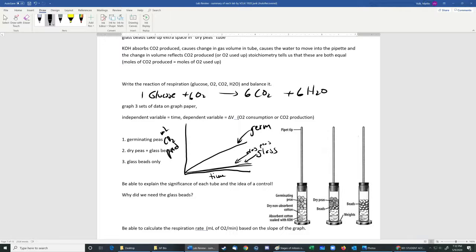We should not be looking at the peas as photosynthetic plants at this point. There isn't any photosynthesis going on because the peas are at a place in their life cycle where they're using the stored up energy in the seed itself, sort of to get the plant going, to start growth. And then eventually, once leaves grow and everything, photosynthesis will start. But that hasn't happened yet. So we're purely strictly looking at respiration, and the green color of the peas shouldn't confuse you here.